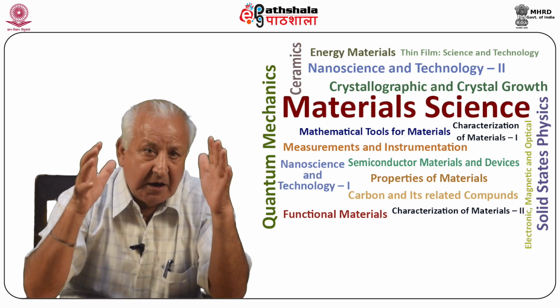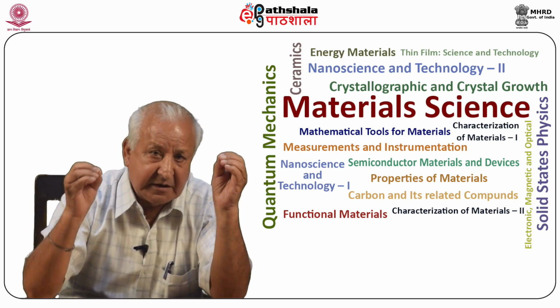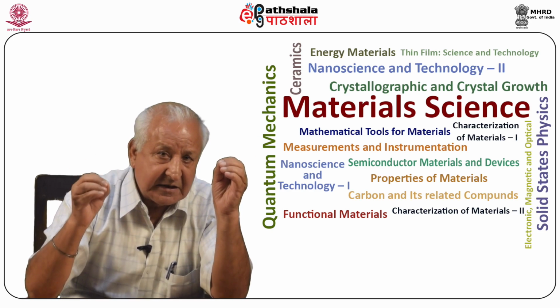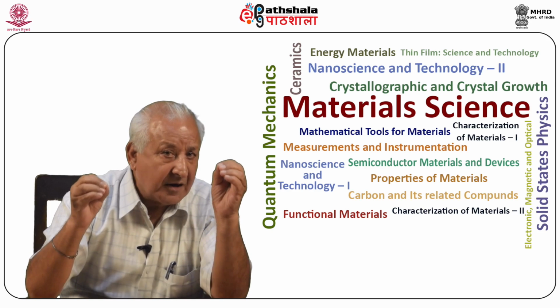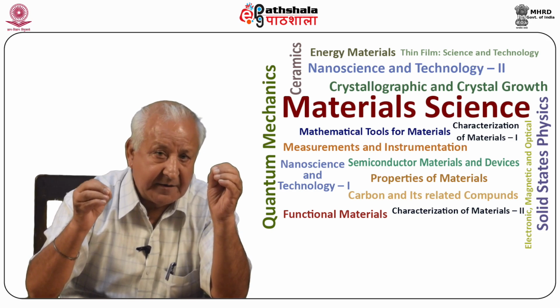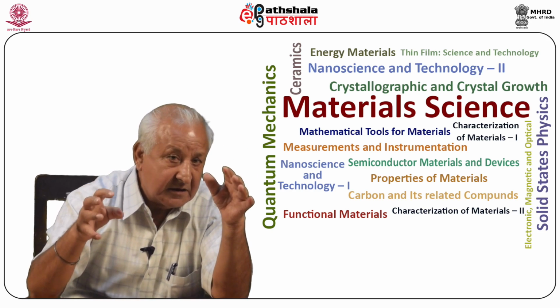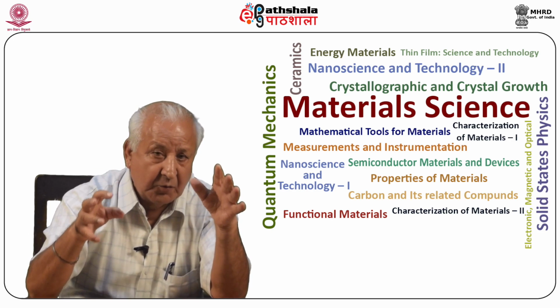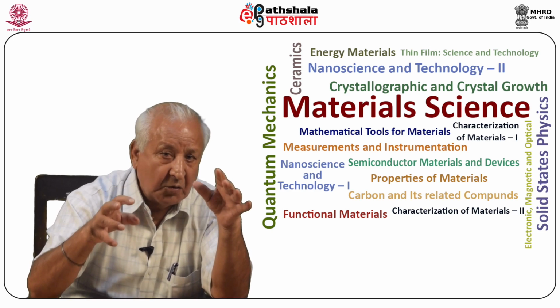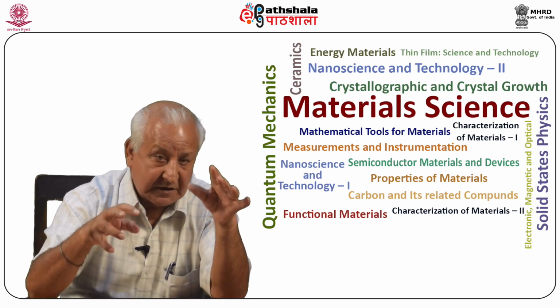Modified technique. In order to suit the requirements of growth for some specific materials, as well as to improve upon the existing techniques for obtaining larger and better quality crystals, the basic techniques were modified. One of the modifications includes the hybrid gel technique, which was used by Arendt and Huber in 1972 for the first time for growth of crystals of Ag2H3IO6.